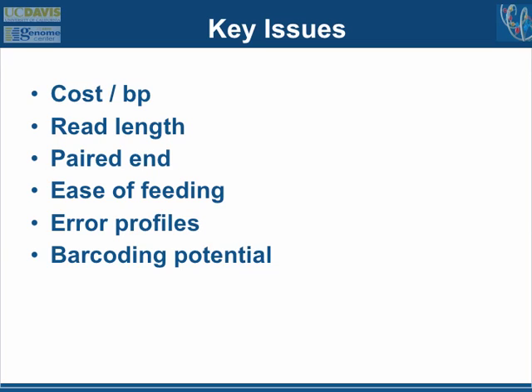Mixing together samples and tagging them in some way and feeding them into one sequencing run is the big challenge that people face now. How can you put together 100,000 samples into a single run of the machine? Because for many studies, you don't really need more than a few thousand or tens of thousands of sequences per sample. What you need are to be able to collect tens of thousands of samples and feed them into the machine.